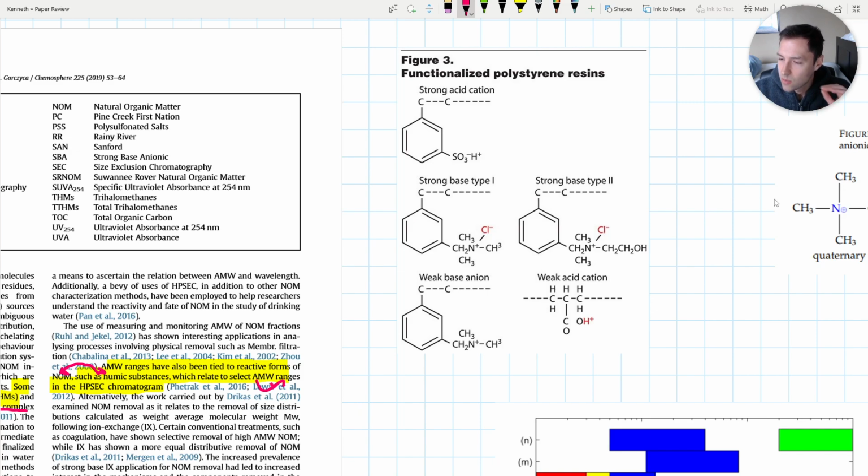acidic group attached to the humic substances. When it comes to humic substances, a lot of them are things like carboxylic acids. So if we know the humic substances exist, that they're mainly characterized by absorbing at 254, and that they are mainly acidic, we can set up a resin where, when we pass our water through, this Cl minus can form with the H plus and the acidic groups and actually exchange.